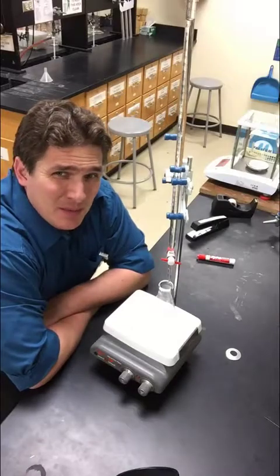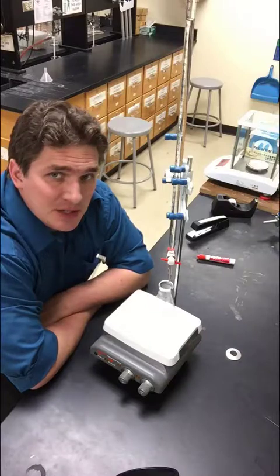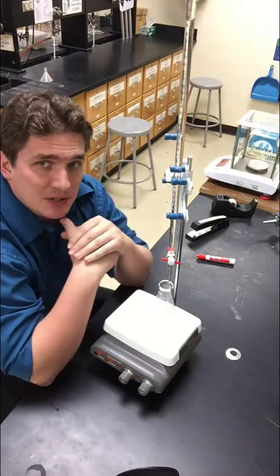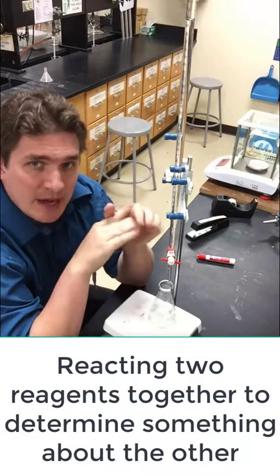So if you're in Chemistry 1, we may not have gotten to titrations depending on where we are in the semester, and if you're in Chem 2, you may have done titrations, but you don't quite remember how they work, what they're about. So this video is kind of just meant to give you a big picture view of what a titration is.